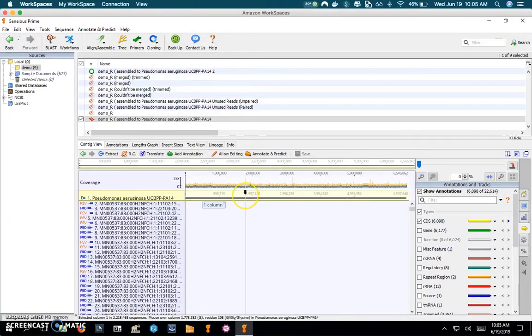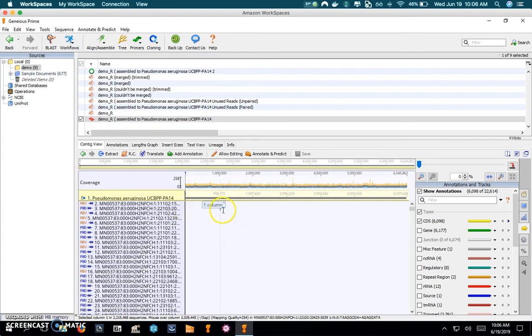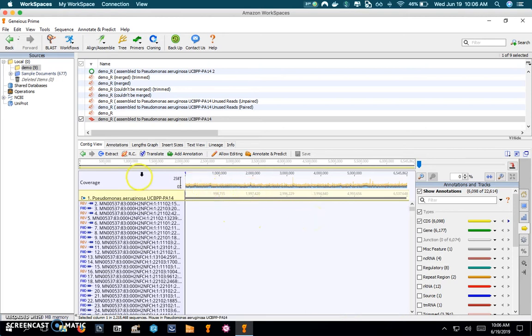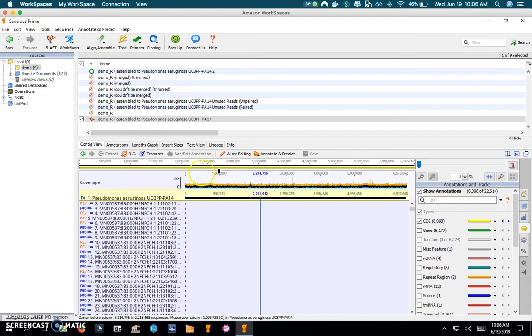The second track is the actual reference sequence for Pseudomonas aeruginosa, and then below that are all the sample reads, both the forward reads and reverse reads arranged in order. So one thing we want to note here is the coverage.